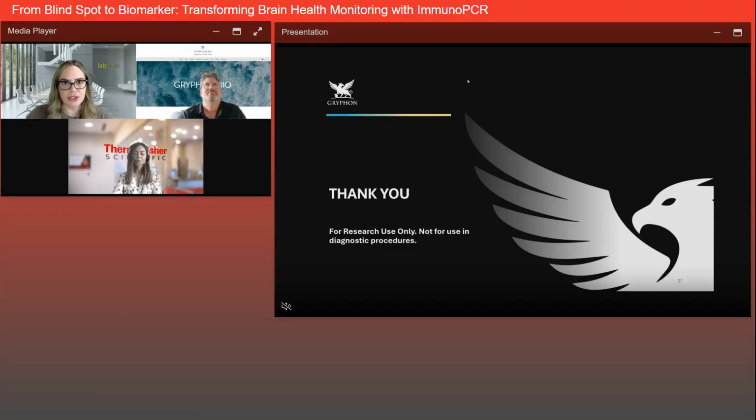Perfect. Thank you so much. It looks like the next couple that we have here are for Dr. Haskins. The first one here says, what are useful detection limits for the ImmunoPCR methods used in your TBI and AD work? And would there be a benefit in pushing to lower limits? Yeah, it's a great question. We generally try to develop assays that have a lower limit of quantitation somewhere in the single digit range, picogram per mil, so 1 to 10 picogram per mil. Is there a need to go lower to like femtogram per mil? I think the answer is yes.